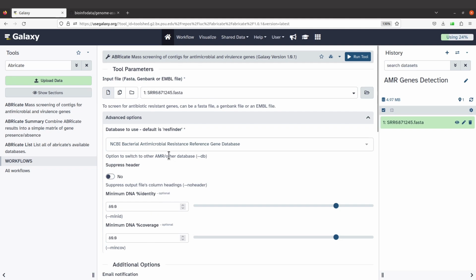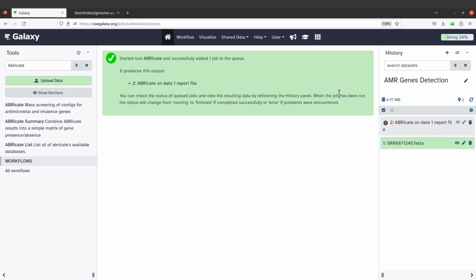So this is a demo. So it's supposed to help you get started. So I will keep it simple. Now we are done. So what we have to do is to come to this side, round 2. All right. So click it. And then when you click it, you will see the output being displayed here for you. So you have to wait until the background is green. At the moment, it's still processing. So you have to wait for everything to get done for you.